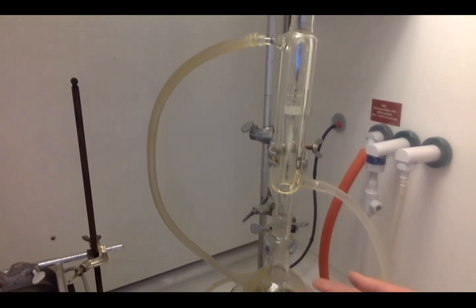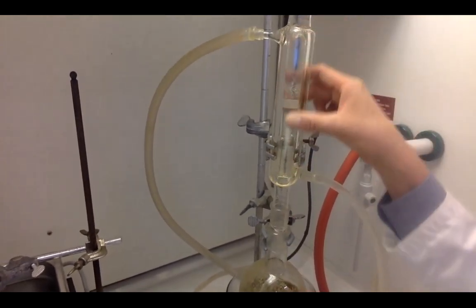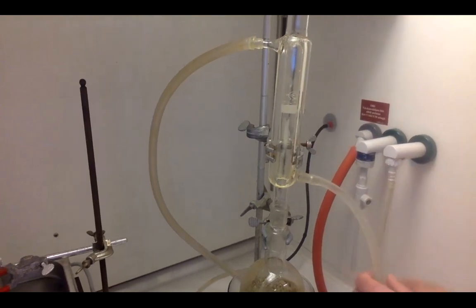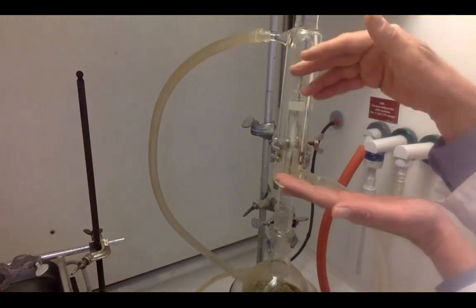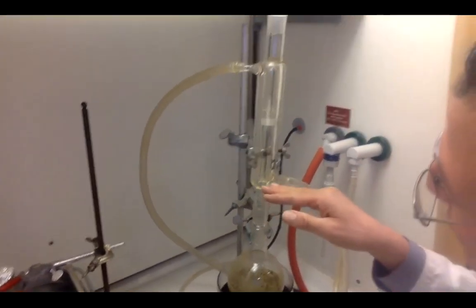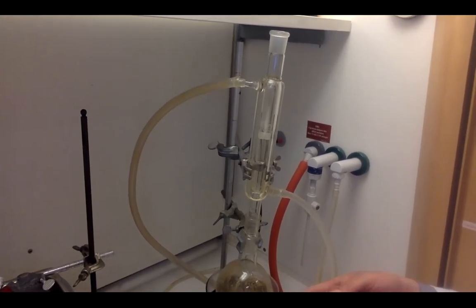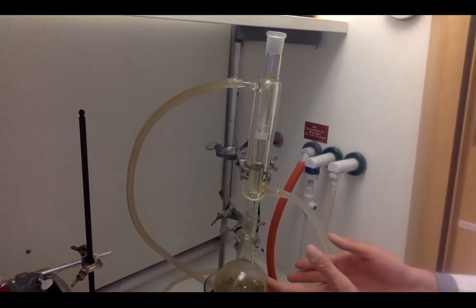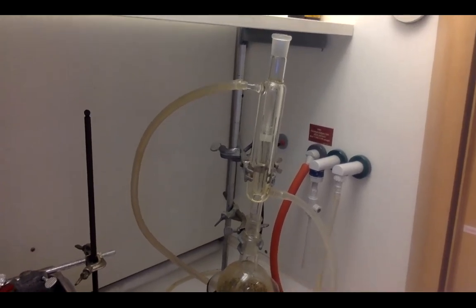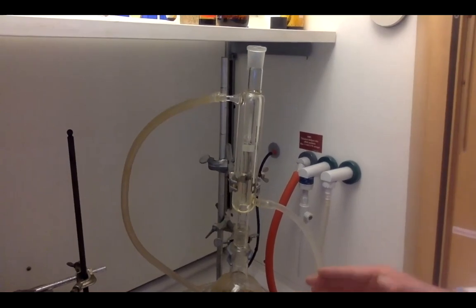You put the mixture on a shaker overnight — that is one way. Another way is reflux, using for example methanol or ethanol/water. When you do reflux, the vapor goes up and faces the condenser. The condenser has cold water flowing in and out, so the vapor faces the cold system, condenses, and circulates back down. The advantage is it is very quick — only one to three hours depending on the amount.